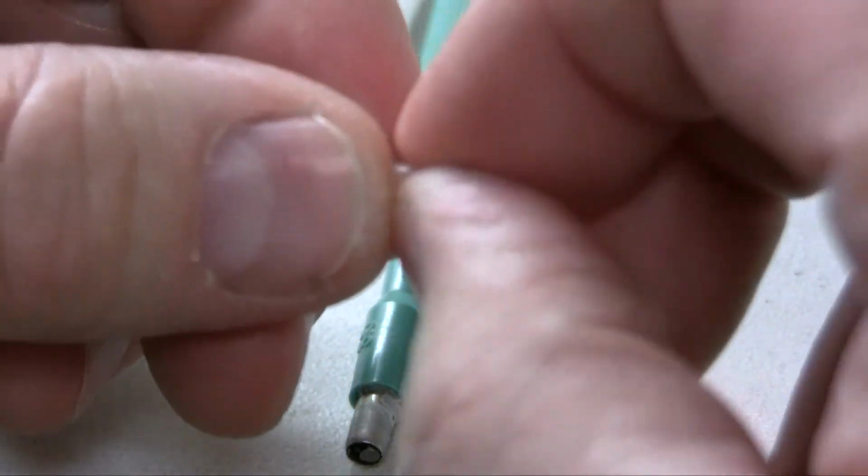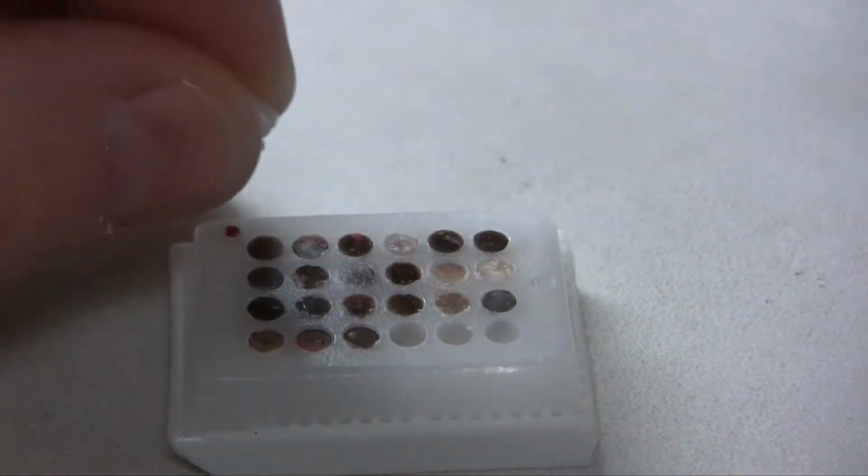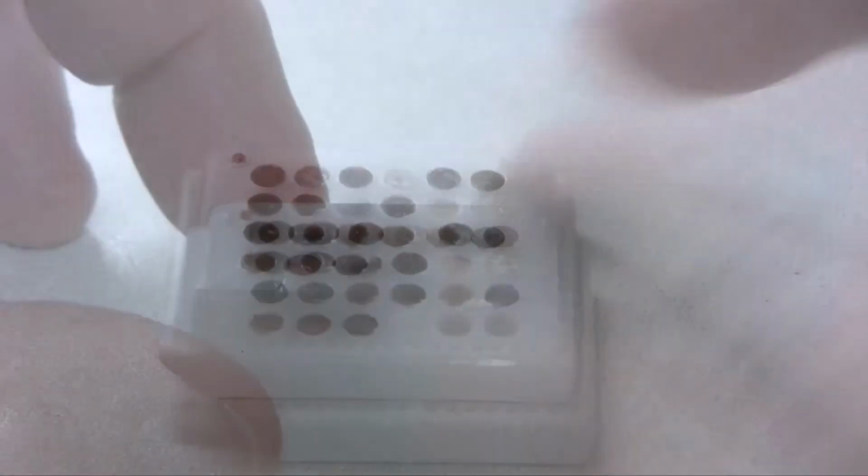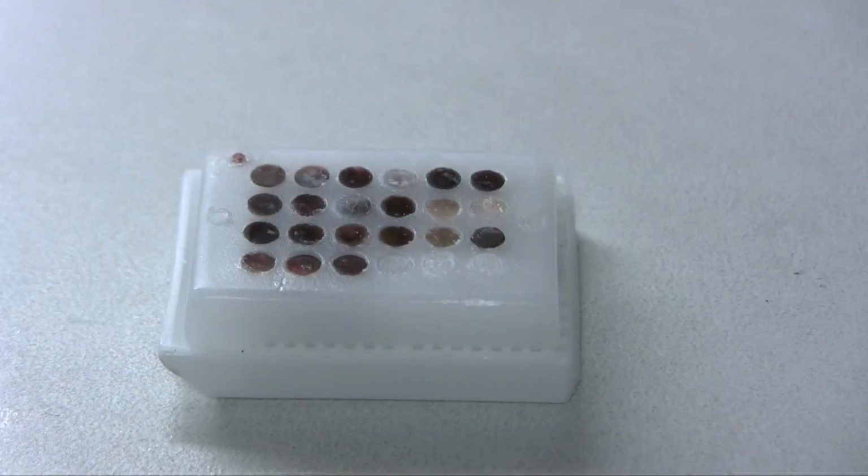When you extract blank paraffin cores, you will find that the stylet will leave a dent in it. Pinch the dent together to make it round, then put that end in your TMA first. This makes it easier to insert the blank paraffin cores into your TMA.